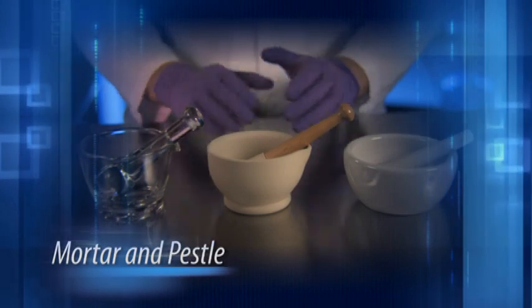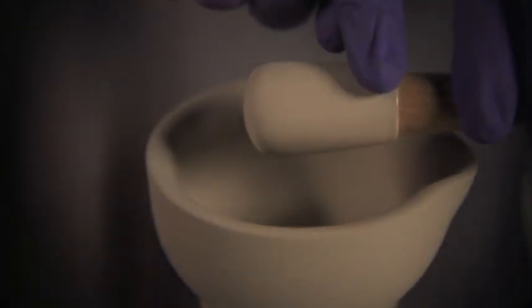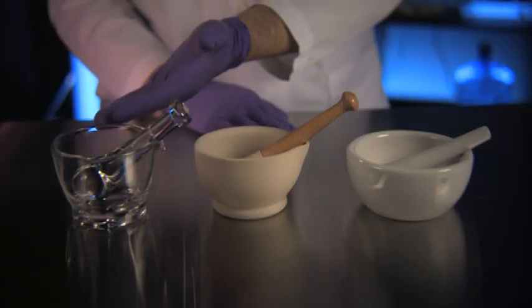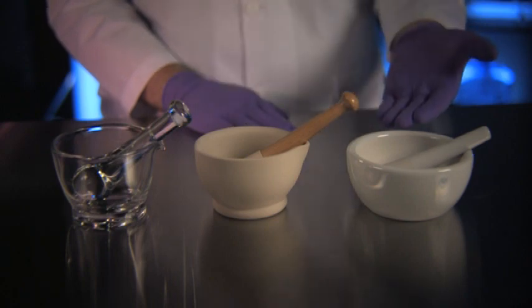The mortar and pestle is a piece of equipment most often associated with pharmacy practice. The mortar is a bowl and the pestle is a grinder or pounder. The two pieces are used to crush and mix ingredients during compounding. They can be made of glass, ceramic, or porcelain and come in many sizes.